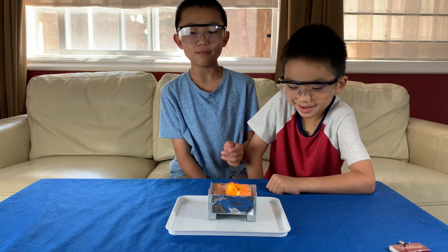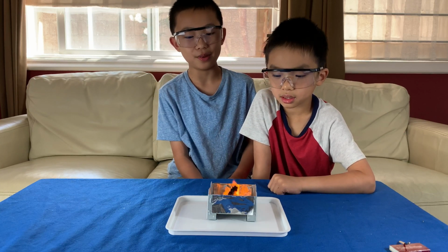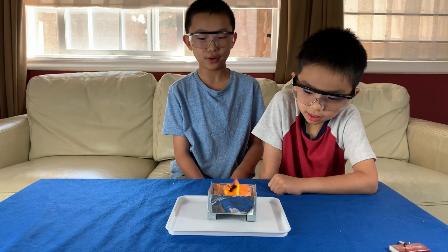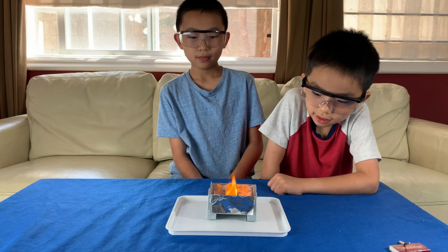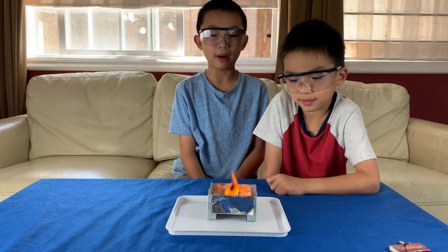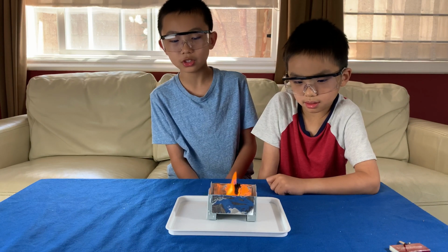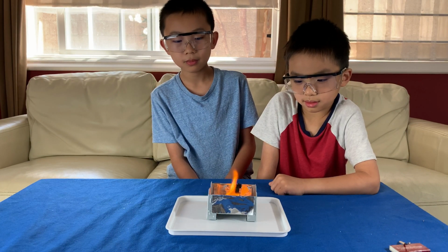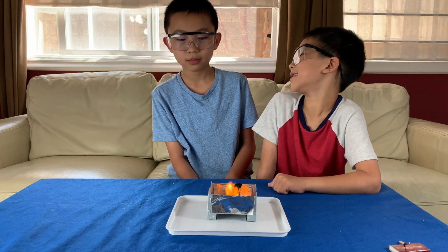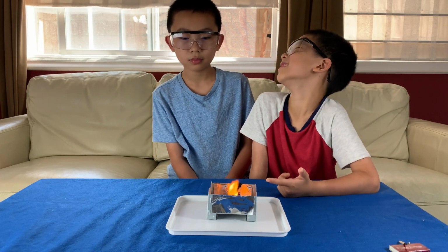I think we might have put the tablet too much on one side. It's not exactly in the middle. But the good thing is we have the foil. So don't touch the foil. It might be burning hot. Uh-oh. The thermal isn't burning. Okay, so the snake is going to take a while to grow. But you'll see it grow. Uh-oh, it's going in the wrong direction. Wrong direction, snake. It might pop out, and that might fall.